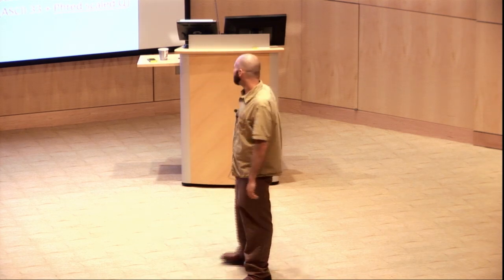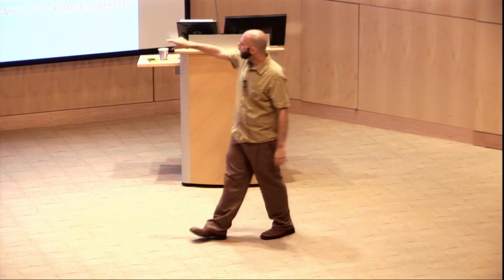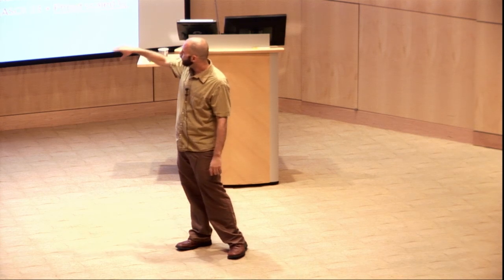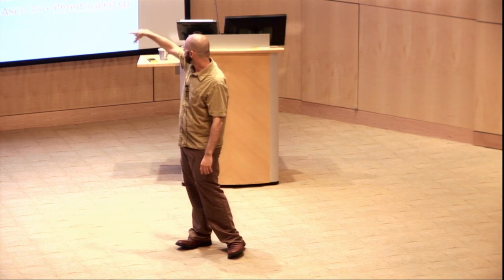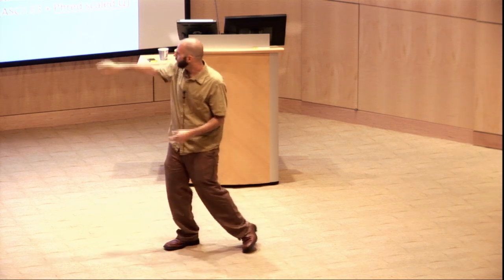So it's just a plus sign. Every time, a plus sign. And then after that, you have another string, which is the string of quality scores. And that string is going to be the same length as the base sequence. And this is a fancy encoding, which is ASCII plus 33, right? So 33 is like the first printable character in ASCII. So you take a number, add 33 to it, and that's what you get right there in ASCII.